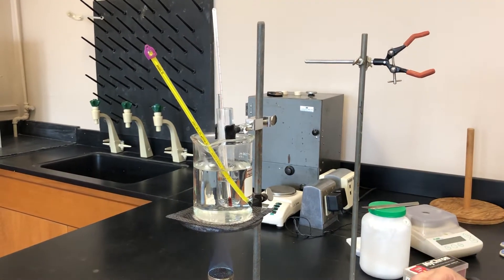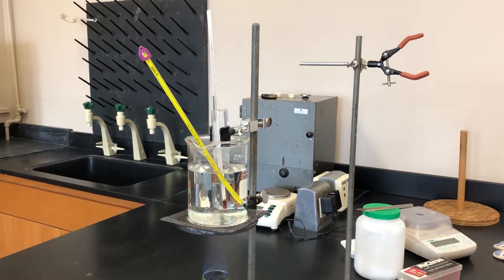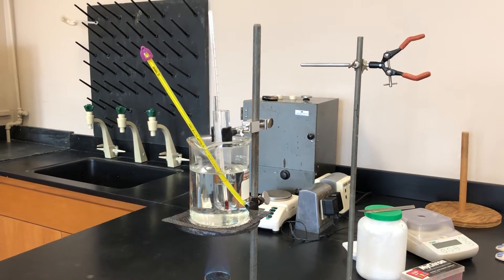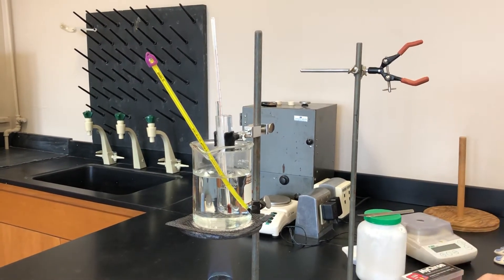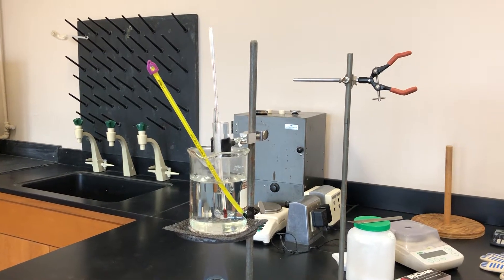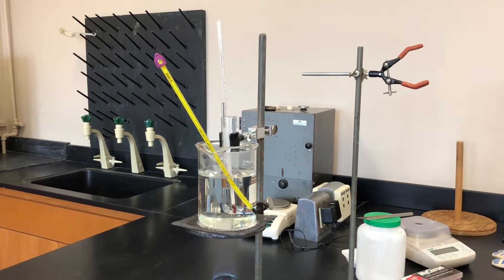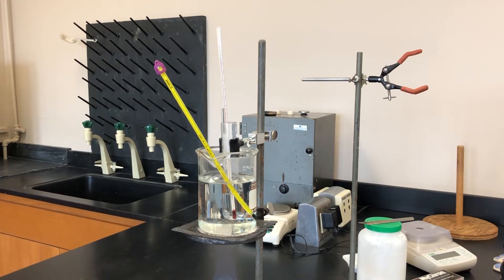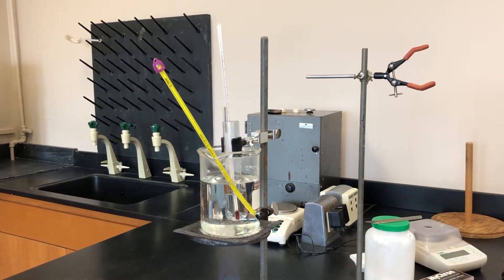When it gets down to 85 degrees Celsius, you need to start taking measurements of the temperature — your first one should be 85. Then you're going to take a measurement every 30 seconds. You can use the clock on the video to watch how many 30 seconds have gone by and take your temperature. We're not going to tell you when to take it, so you need to remember when it hits 85 to start. Worst case scenario, it's recorded so you can rewind and go back.